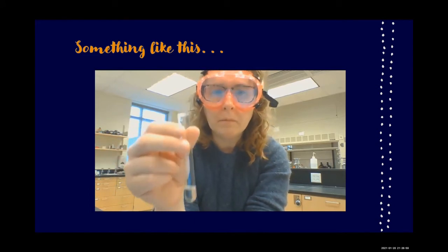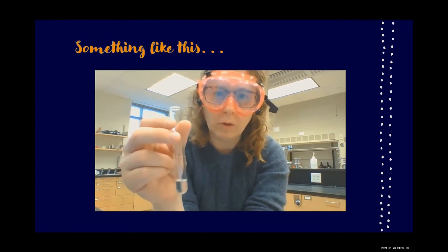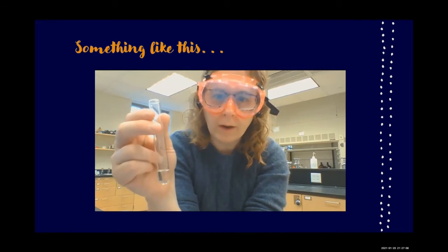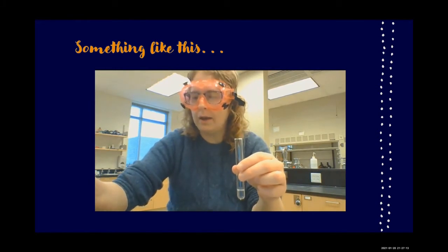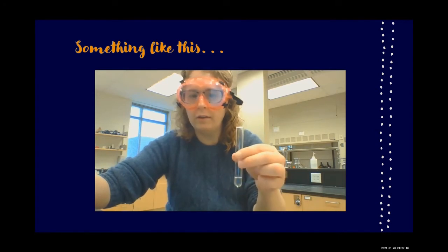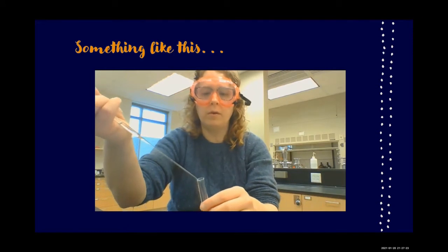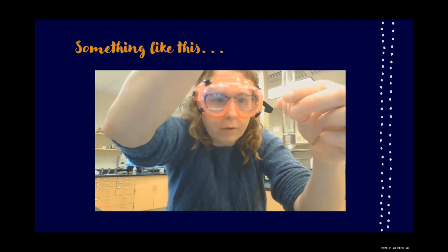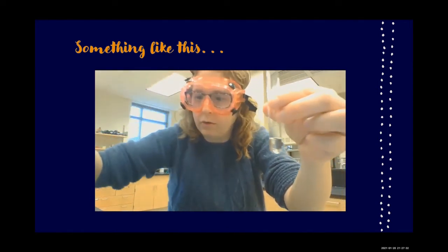So the physical process that we're looking at right now is a saturated solution of sodium chloride. What that means is that the solution cannot hold any more sodium chloride than it already has. It is at equilibrium. And I'm going to disturb that equilibrium by adding HCl. And if you pay attention to the chemical formulas, of course, you know that HCl and NaCl have an ion in common. So that ought to affect the equilibrium. You hopefully should have a prediction about in which way. I'm just going to add a few drops of very concentrated HCl to my solution. And I'm going to give it a stir.